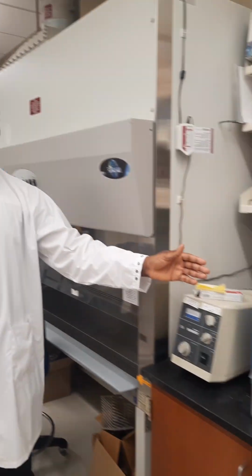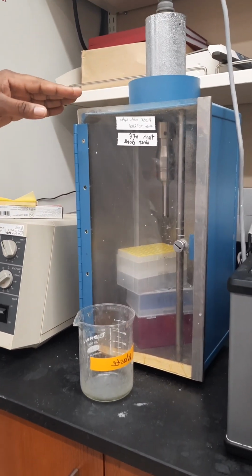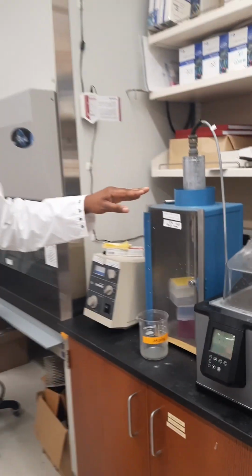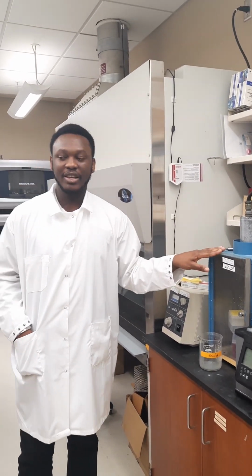I'm going to say this first is what we call our sonicator. So remember I told you we do a lot of biochemical reactions. This is basically used to sonicate our bacterial cells. By sonication, I mean breaking down our cells to release the protein.